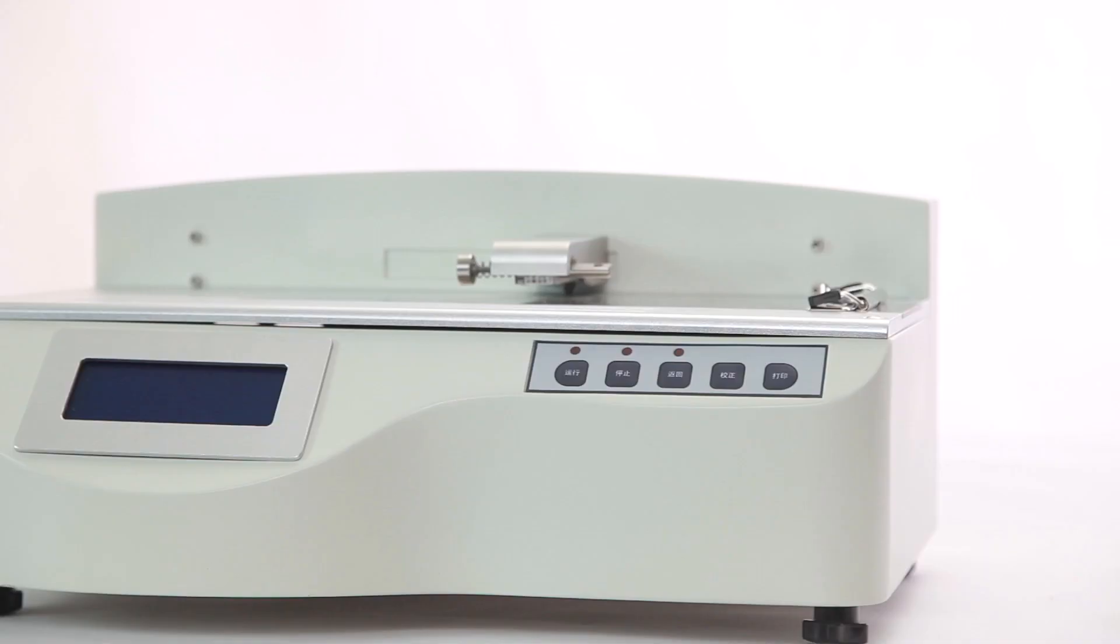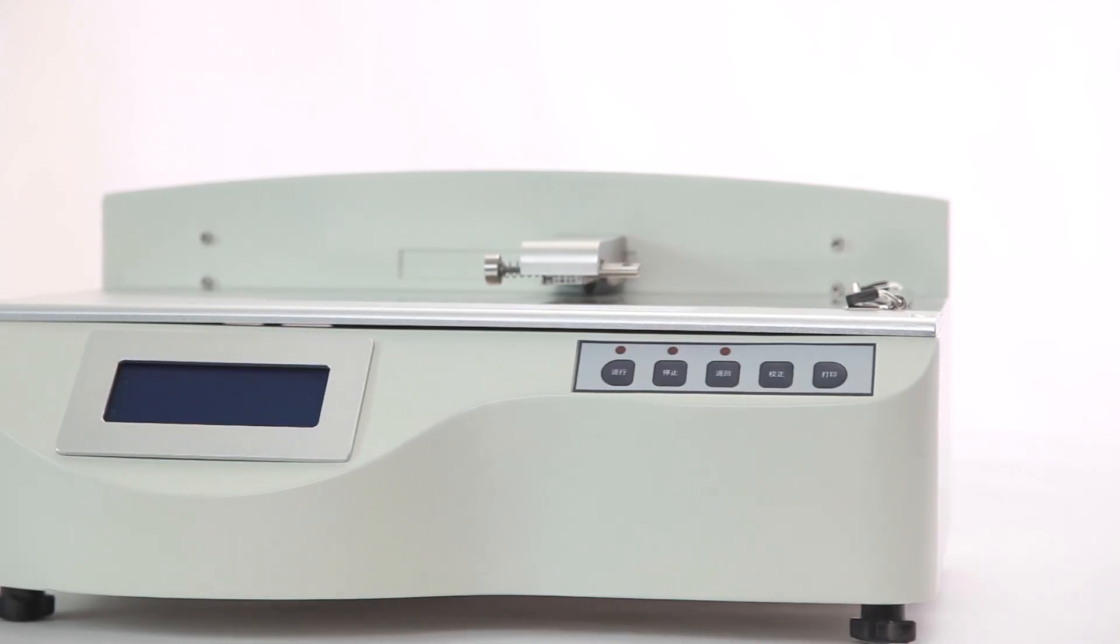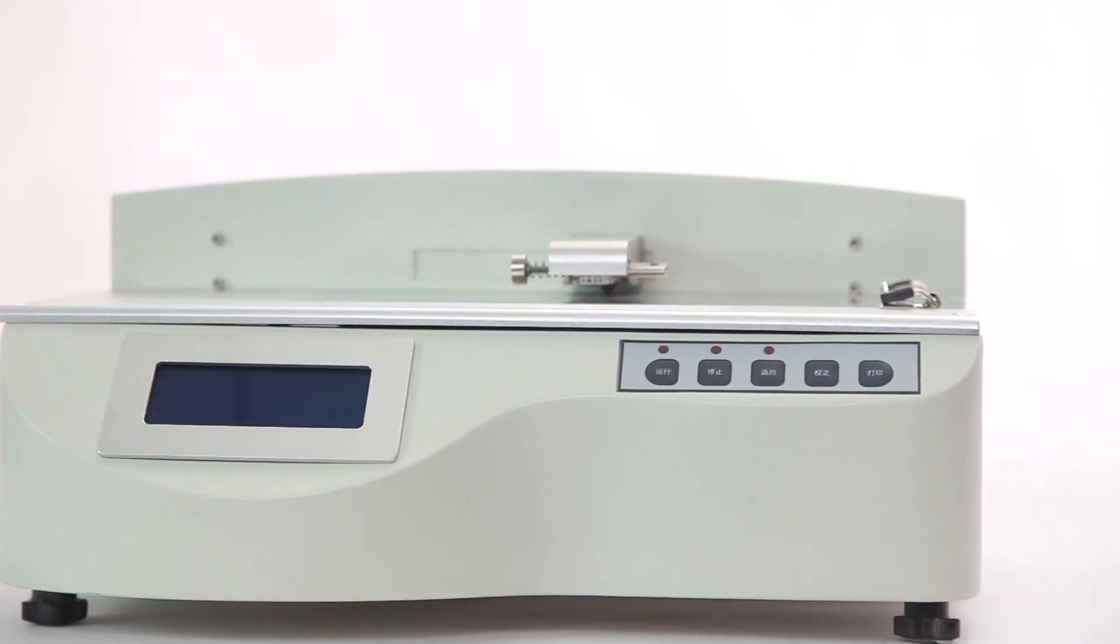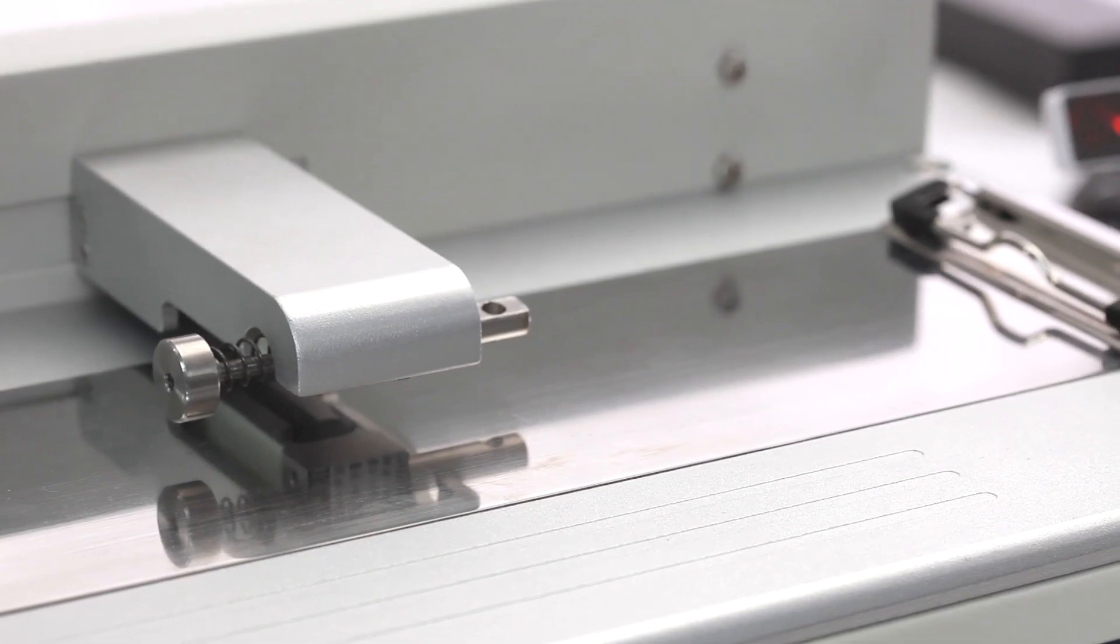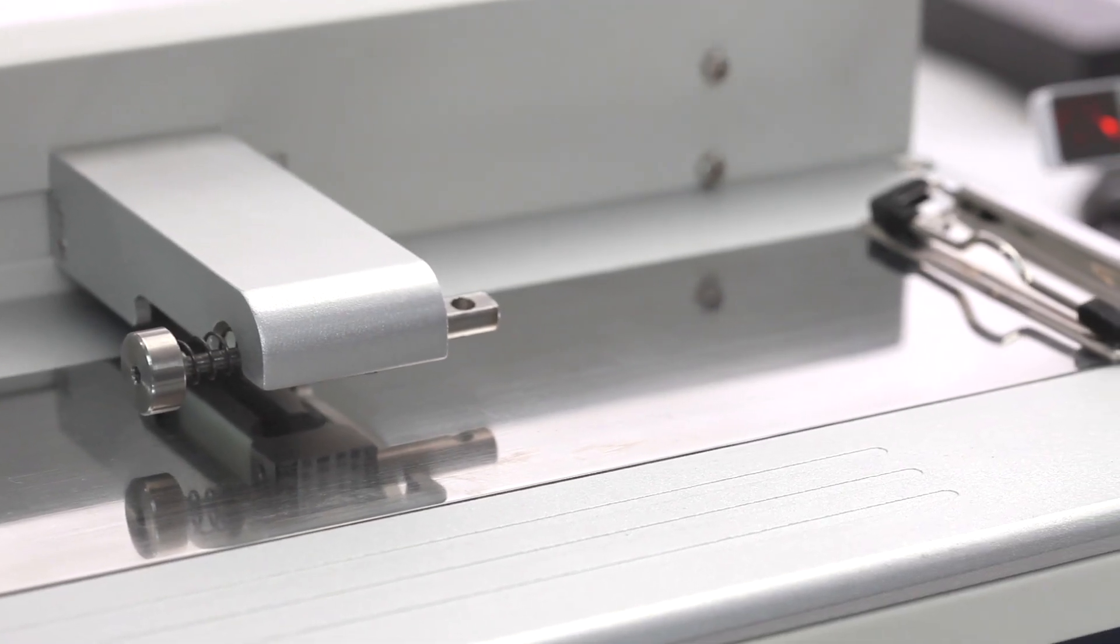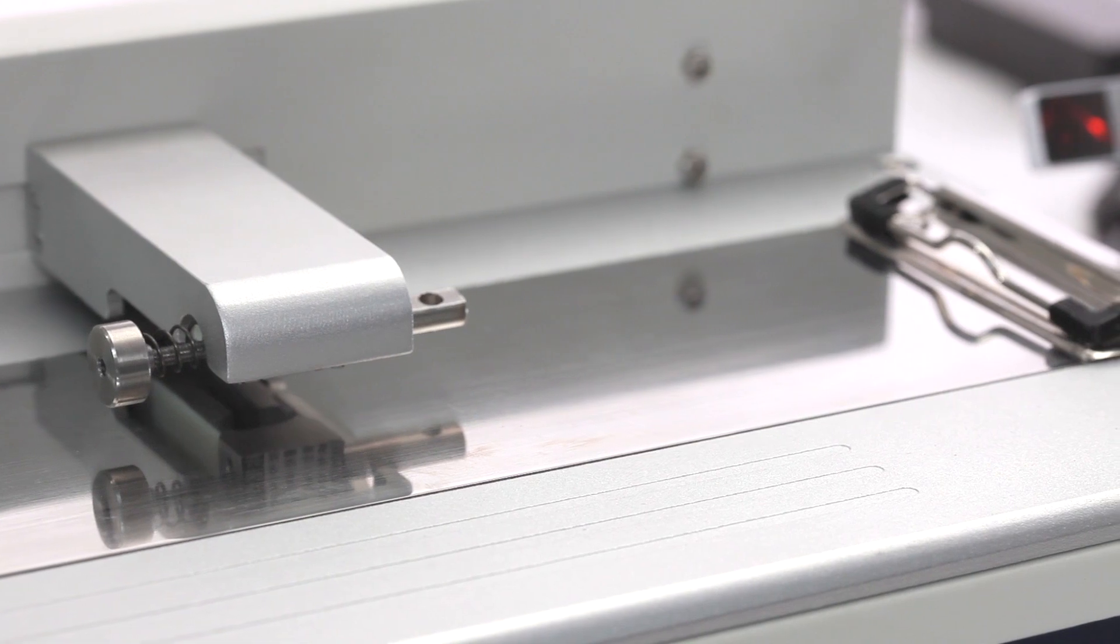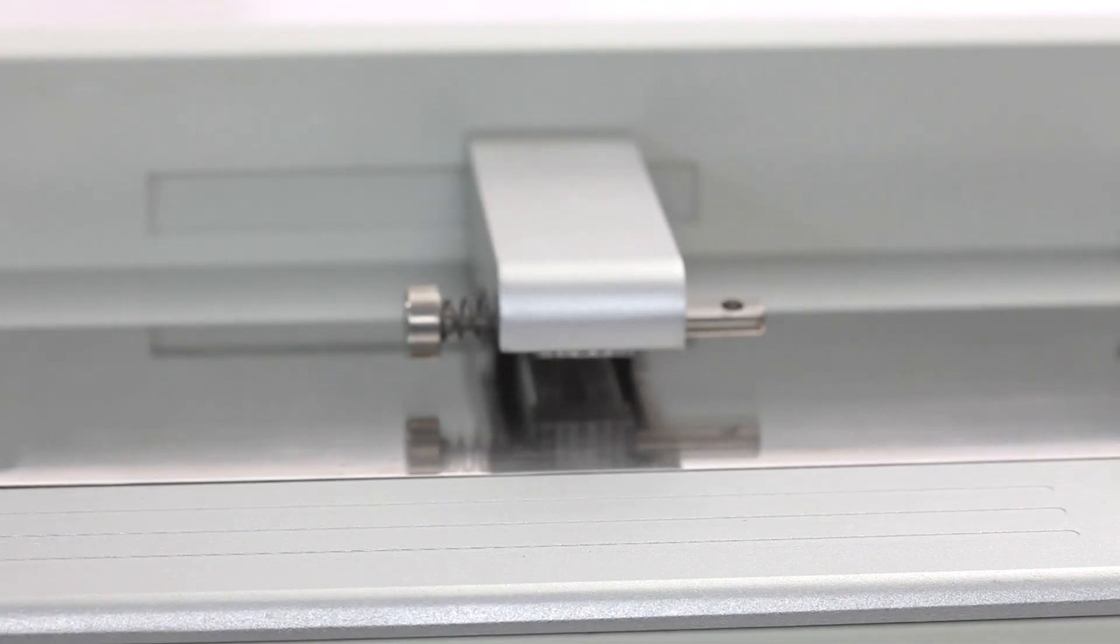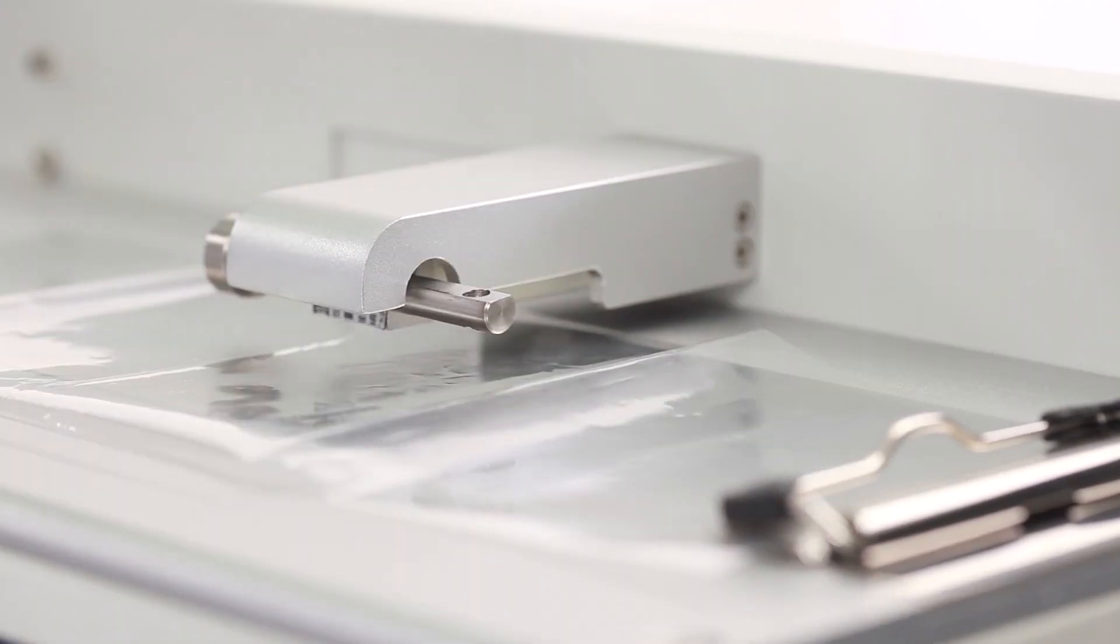GM1 and GM4 coefficient of friction testers test the static and kinetic coefficient of friction to evaluate the smoothness and deepness of plastic film, paper and other materials.